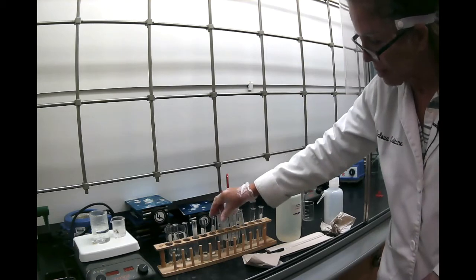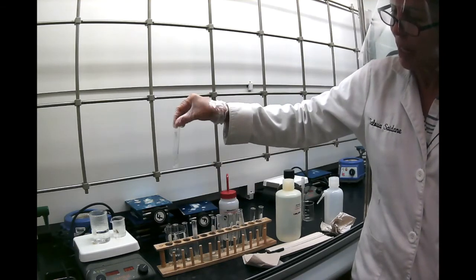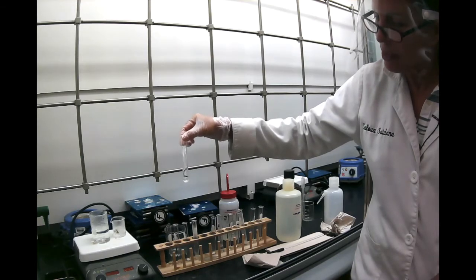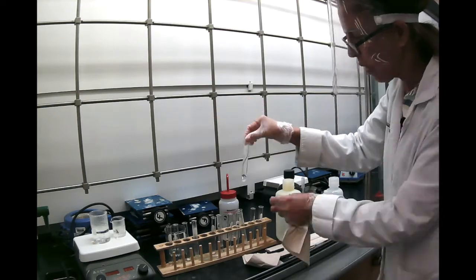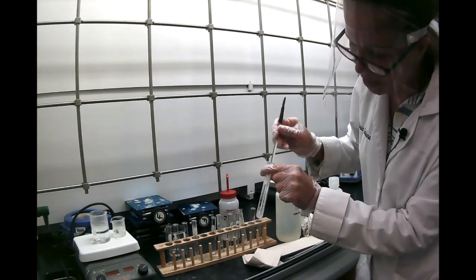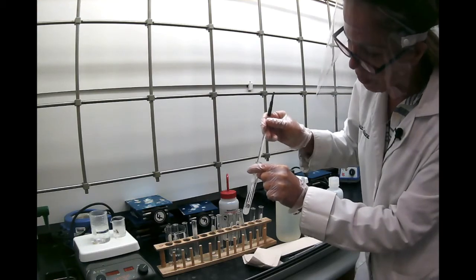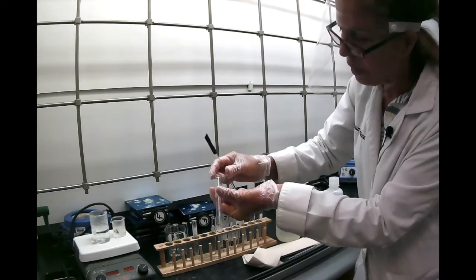That's our benzoic acid. Now, this is naphthalene in alcohol. We saw that it doesn't dissolve in water. And since alcohol and water are similar, we should expect similar results. So it doesn't look like it's dissolving in cold alcohol. I'm going to stir it a little bit with the stirring rod. Make sure your stirring rod is always clean. And just like we did before, if it doesn't dissolve in cold, we're going to heat it a little bit.